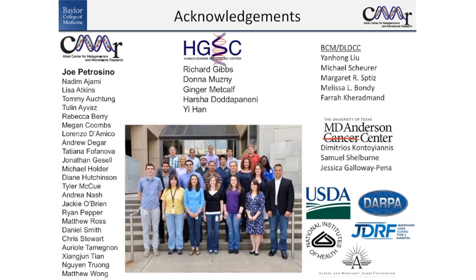Yeah, so it shouldn't change the identification of the species. We focused in on V4, but we do run V1 and V3 as well, and even V5. So we've validated those studies comparing V4, which is our gold standard, to them, and we get similar results. It just so happens that our pipeline was developed around V4, so that's kind of why we stick with that.